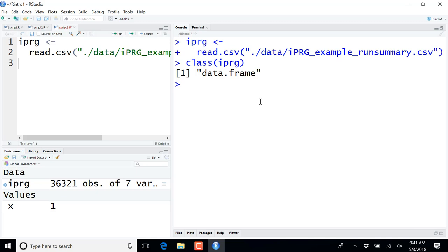A second essential property of the somehow convoluted way that I explained what the data frame is, is that all my log2 intensities must be numbers. It is not possible to suddenly have an A in here, which is fine in an Excel spreadsheet. You can really type anything anywhere, and Excel will not complain. Excel will actually try to help you and convert gene names to dates because they look vaguely similar. This is impossible to happen in a data frame because every element in that column, which is a vector, must be of the same type.